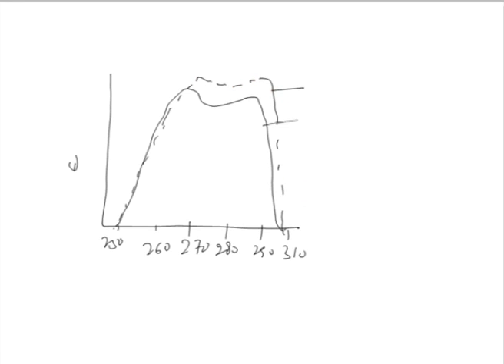So, these are two spectra here. One is in ethylene glycol, which is less polar, and another is in water. So, you have two of these spectra here. One spectrum is in a polar and another is in a less polar solvent. You can see there is a lambda max increase here. The lambda max is increased in the case of the ethylene glycol, the less polar solvent. So, polarity will certainly affect the lambda max and also the molar absorption coefficient.